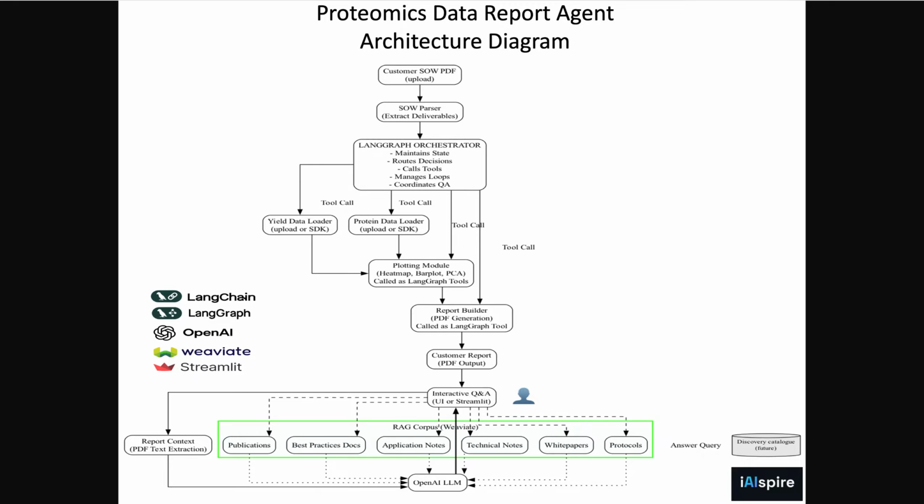Right now this demo only uses publicly available data, and the LLM that is powering all of this is OpenAI, and the other tech stack is LangChain, LangGraph, OpenAI, Weaviate for the RAG, and Streamlit for the UI.